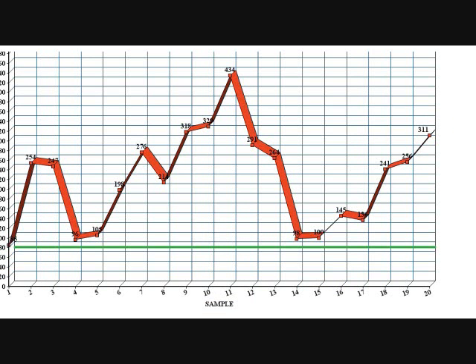Variation of calcium content in the water sample is being displayed in the graphical version, and we observe that all the samples are exceeding the permissible limit of the water, because the water we extracted is all from deep ground, so the earth contains rock in the form of calcium, so the amount of calcium leaching out into the water may be high, and this contributes to the higher value.